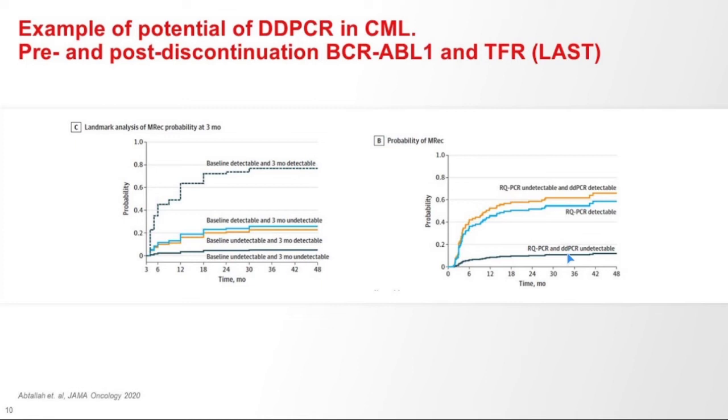So this again showed, in our hands at least, that the droplet digital PCR was probably superior to the standard PCR at these very, very low target levels.